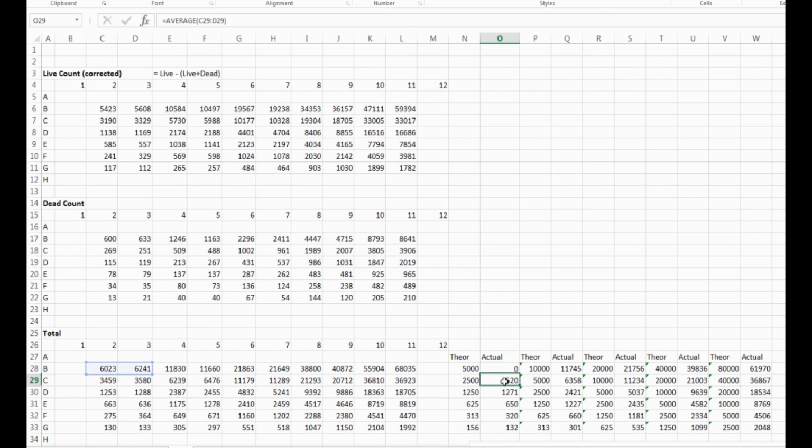So that could be due to my plating, my maybe not so perfect plating. And I do want to comment on that. If your pipettes are not calibrated, or if you have bad pipetting technique, this can throw this whole situation off. So I highly recommend that you have calibrated pipettes and you have a good pipetting technique.